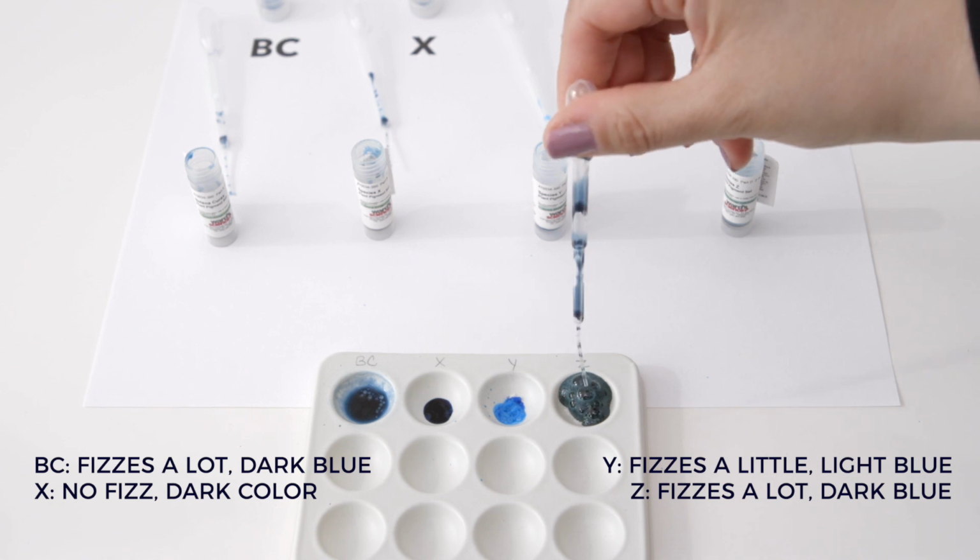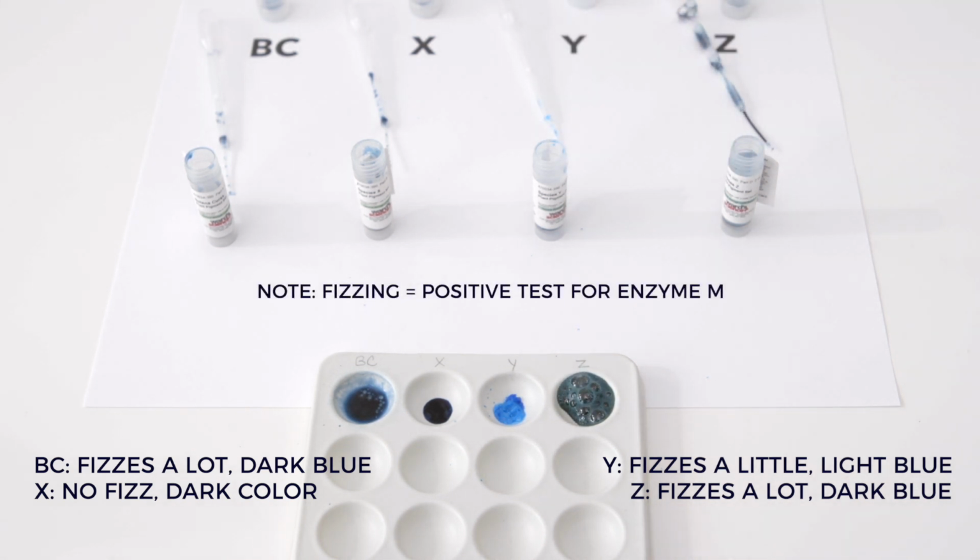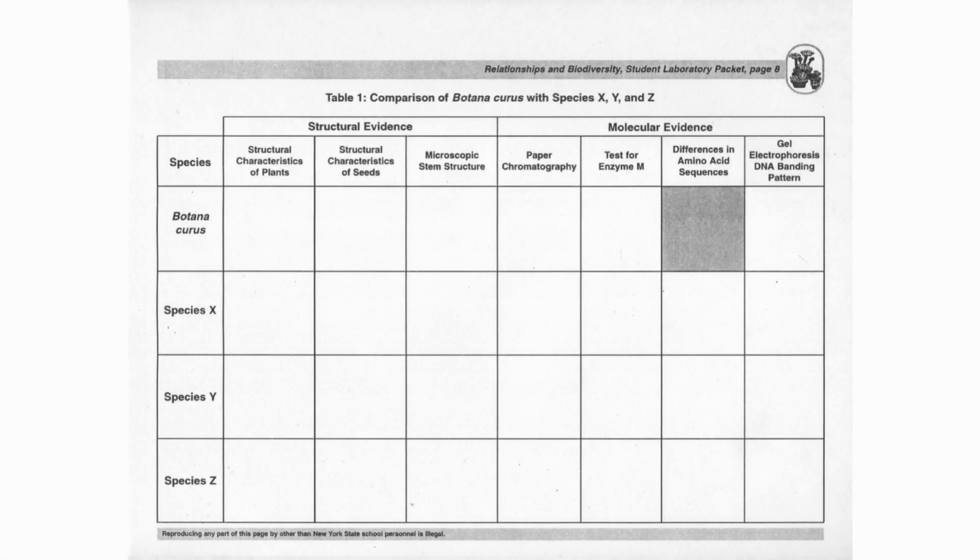Now record these test results in Table 1. Note, if we see fizzing, then it is a positive test for Enzyme M. Once you have recorded these in your data table, continue with the other molecular evidence tests to finish this lab.